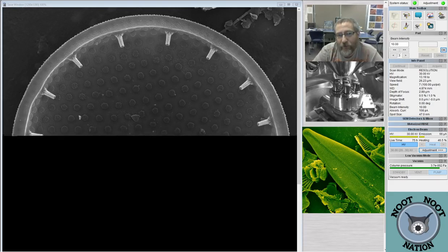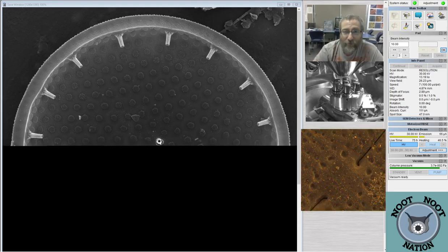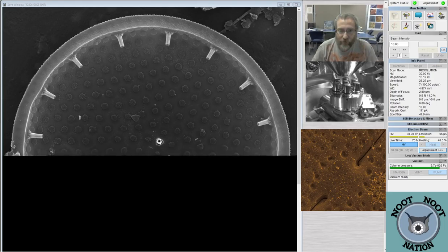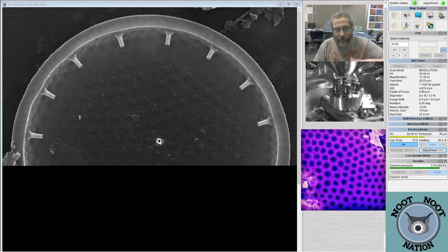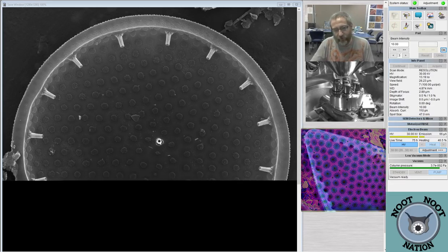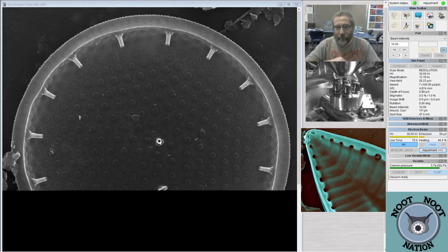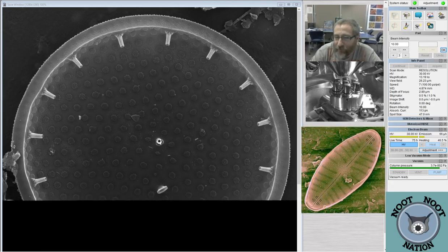And so if I were going to tilt it a lot, like if I wanted to look at it at a low angle, like 40 degrees or something, normally what I would do is take the sample back out of the chamber and take all of the other stubs off and just have that one sample in the middle, so that I could turn it without having to worry about it touching anything. I could also lower the stage down and then tilt it and then bring the stage back up. But one of the problems is it limits how close I can get, right? Because the thing is tilted and it's not the top. So all of those things are totally feasible. They're just not practical for where things are set up right now.